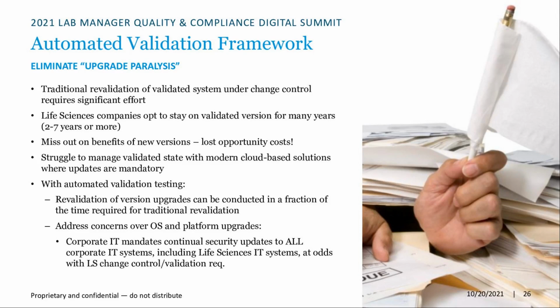The amount of paper that you generate in a traditional validation is just unbelievable, because you have massive amounts of validation test scripts, and then the test results and screenshots, and it just goes on and on and on, to the point where it again leads to why I'm so passionate about eliminating paper in our processes.